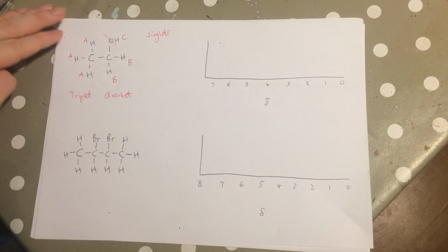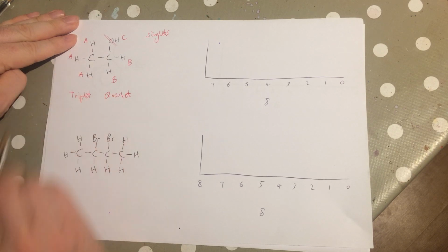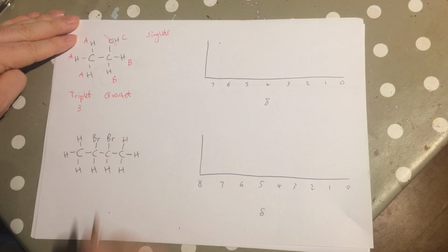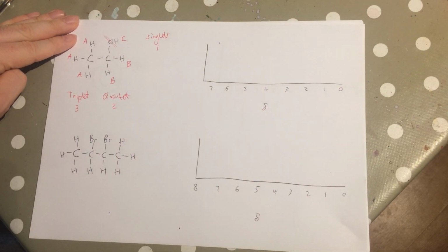In terms of my integration trace or relative peak area, that is the number of hydrogens in the environment. So environment A, I have three hydrogens, so they will have a relative peak area of 3. Environment B, I have 2, and I've just got one OH.